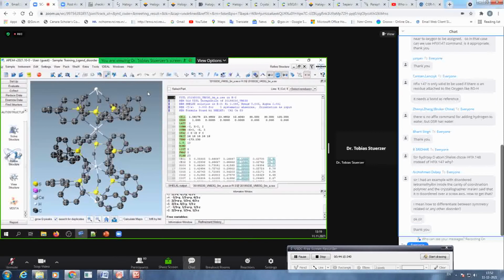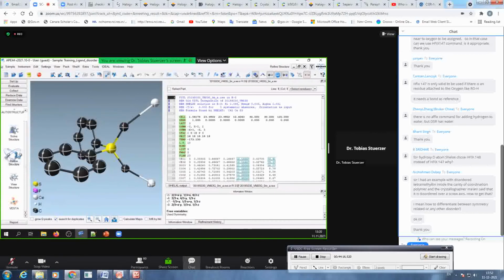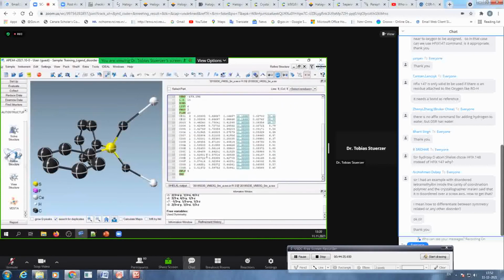Okay, good. So this is the molecule. Now it's a very simple complex. So you have here cerium. This is oxygen, not carbon. And you have here the phosphate or sulfate, I don't know. Can't remember. And benzene. Yeah, should be sulfate, I guess. Yeah. Okay. That looks okay.